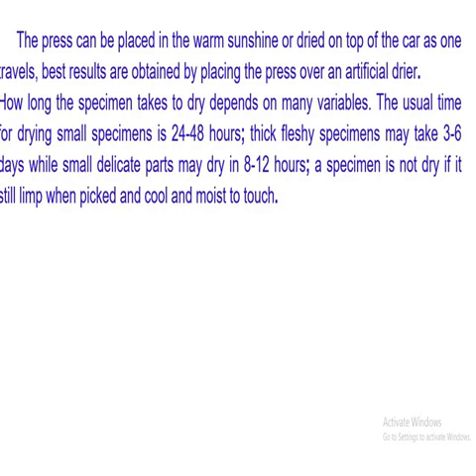But sometimes you'll find some delicate parts. Some plants are just herbs that are too delicate. So about 8 to 12 hours will be sufficient for this particular plant specimen to dry. Now, a specimen is not dry if it will still limp when you are picking it, or it is cool and moist to the touch.